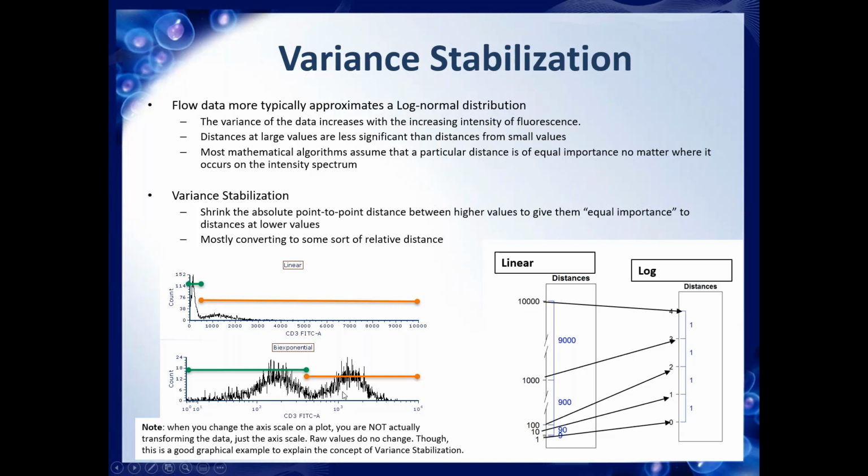In this case, since SPADE needs to perform some mathematical calculation, you are actually converting the value based on the scale. So for example, 10,000 in log scale is 4, 1000 is 3, and you can clearly see that the distance that here in linear scale is not homogeneous becomes homogeneous after applying the log scale.